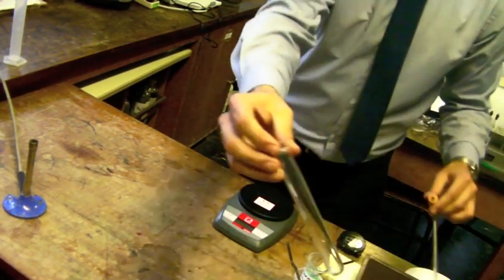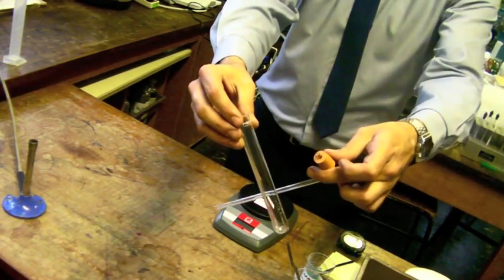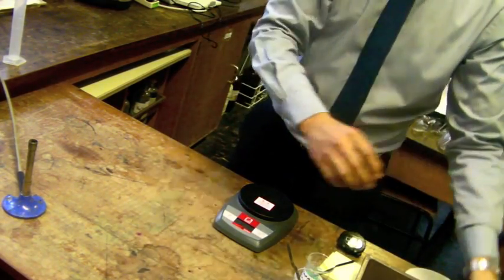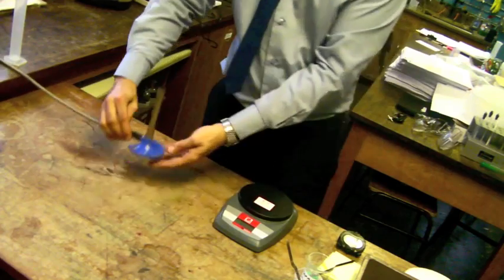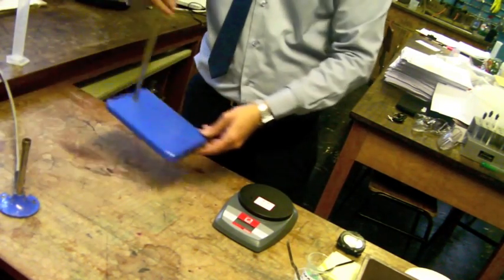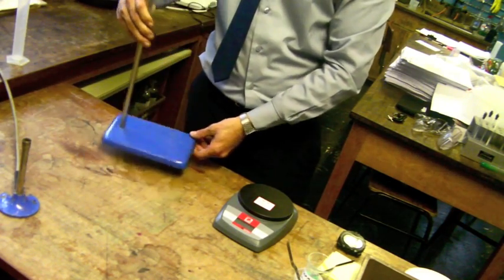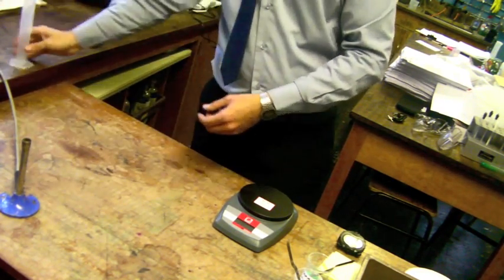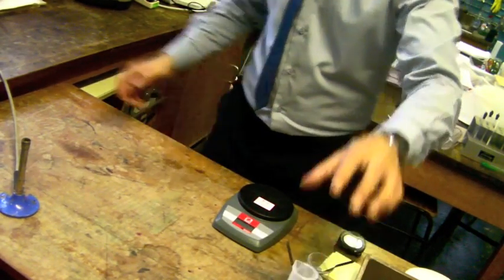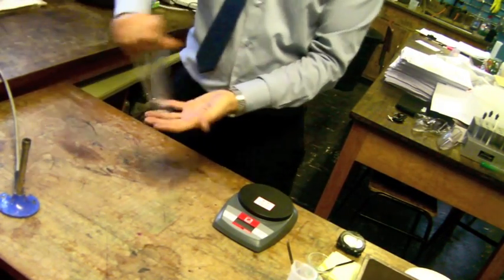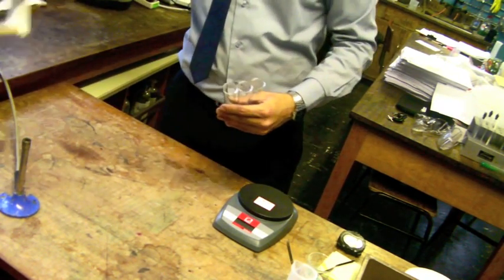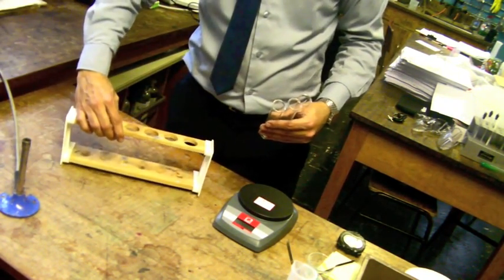You will need a test tube with a bung and delivery tube, a standard issue high school Bunsen burner, a clamp and stand and a measuring cylinder. You will also need three boiling tubes and a boiling tube rack.